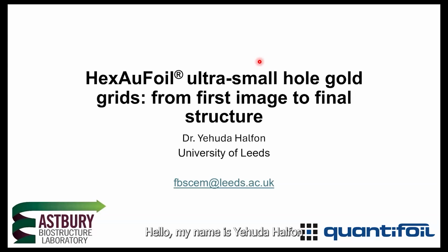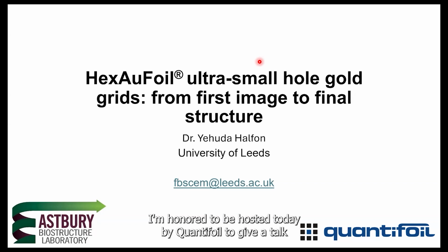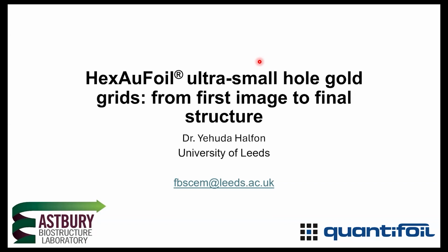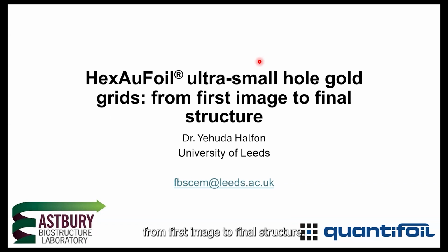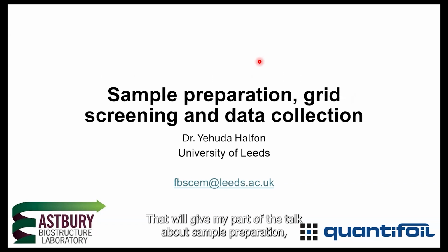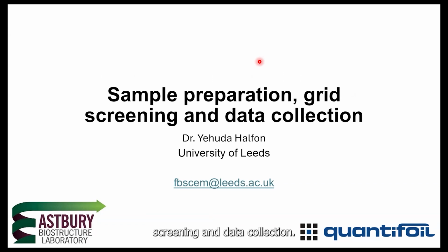My name is Yehuda Halfon, and I'm a cryo-EM scientist at the University of Leeds. I'm honored to be hosted today by Quantifoil to give a talk with my good friend and collaborator, Sebastian Porav. Our talk will be split in two parts. The main title is HexAuFoil Ultra Small Hole Gold Grids from First Image to Final Structure. I will give my part of the talk about sample preparation, grid screening, and data collection.